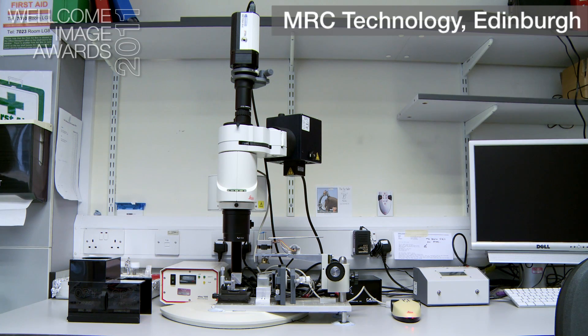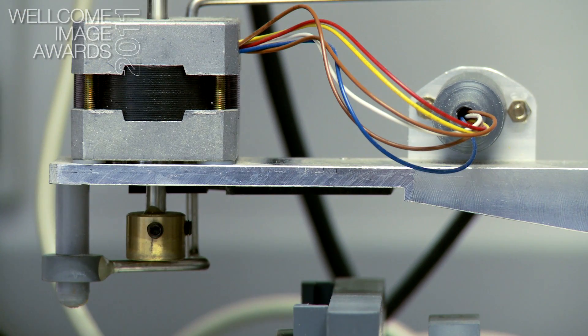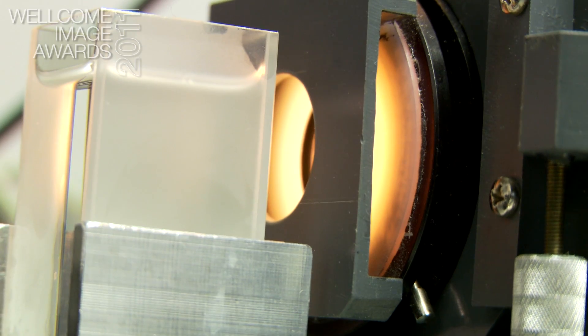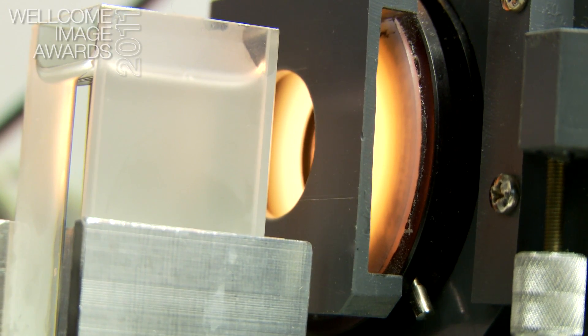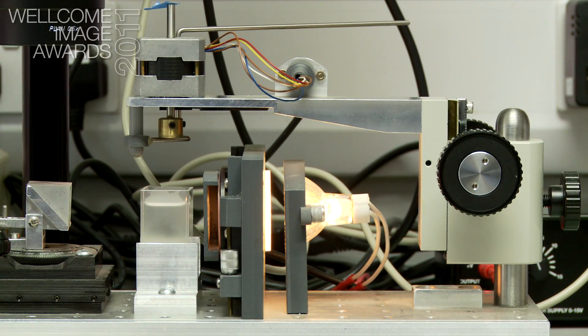This is the original homemade OPT machine. The motor is here and this is connected directly to the position where the sample is attached. Down here we have the imaging chamber. On this side here we have the transmission illumination.